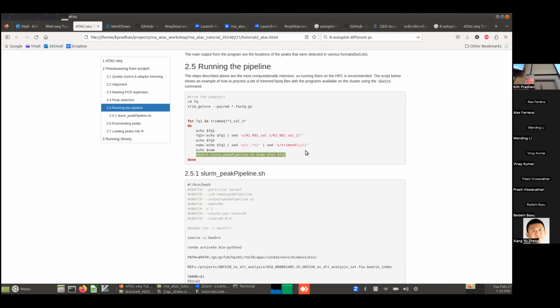I like to do it in a separate file, just so I have a document of all the things that I ran. Plus, I like to be able to look and see what I'm actually running, because it's just so easy to make mistakes here. But you don't have to. Especially if you're familiar with this or you have some experience, you can just submit your data in your loop.